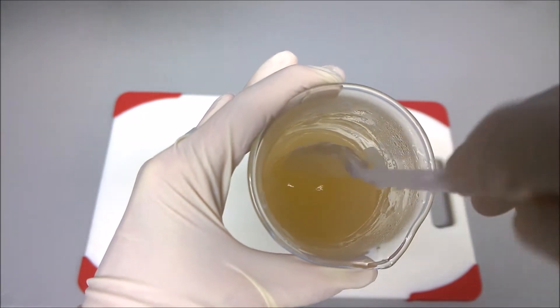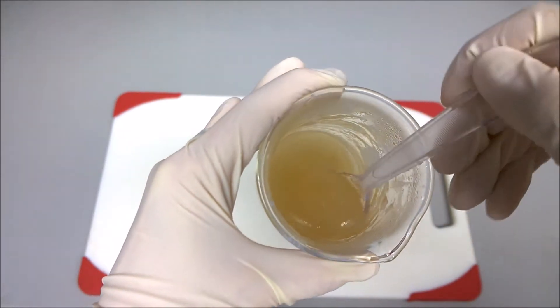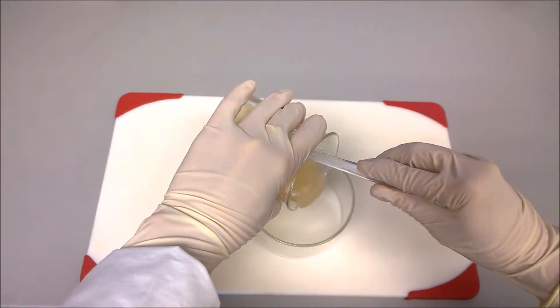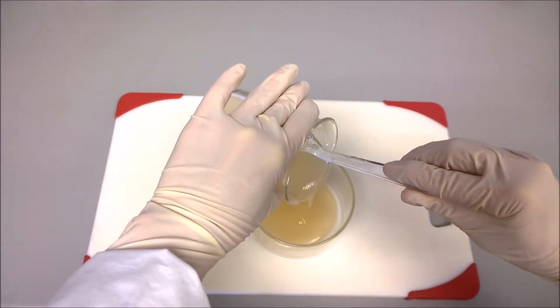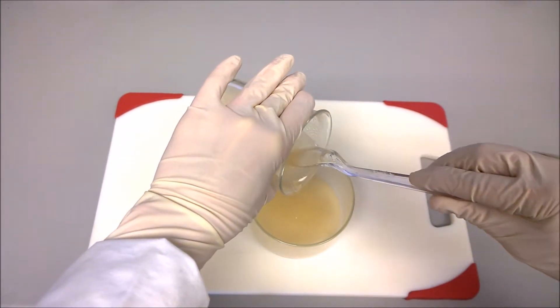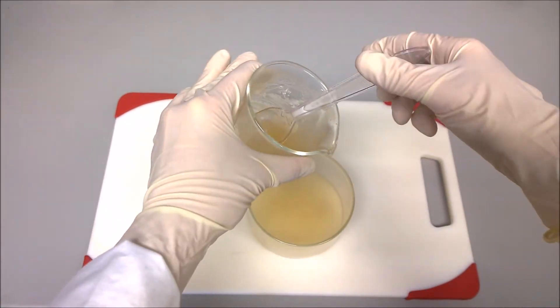Stir the mixture for a minute and then pour in a petri dish to obtain an ideal 3 millimeter thickness. Let it cool down for 15 minutes at room temperature.